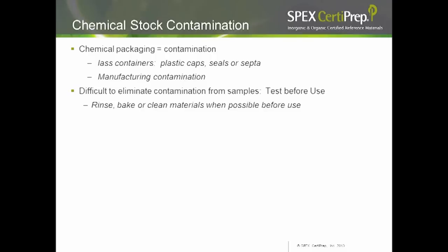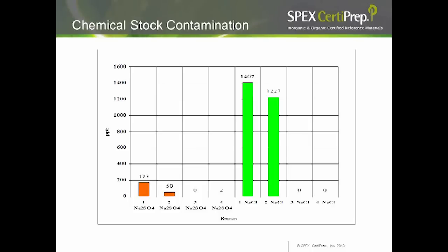A lot of packaging from raw material manufacturers has the potential to be contaminated. Glass containers give sodium and boron, plastic caps, seals, or septa can have phthalates, and there can be manufacturing contamination. Often you need to test starting materials before you use them, and when possible you can clean, rinse, or bake them. We did a small study on sodium sulfate and sodium chloride from our laboratory: after the first solvent rinse, our sodium chloride had 1,400 ppb of phthalates; after the second rinse, 1,200 ppb; after baking in a kiln oven, the phthalate content was reduced to non-existent.